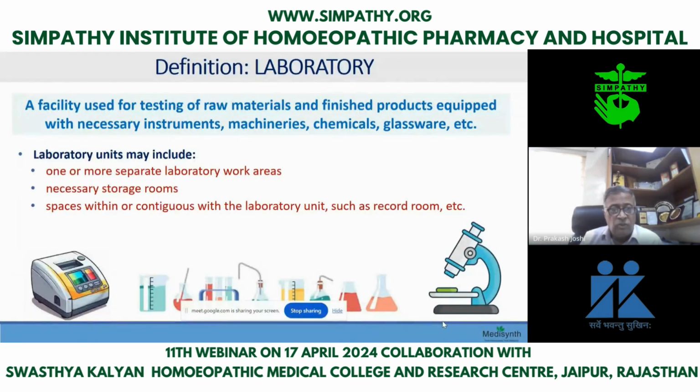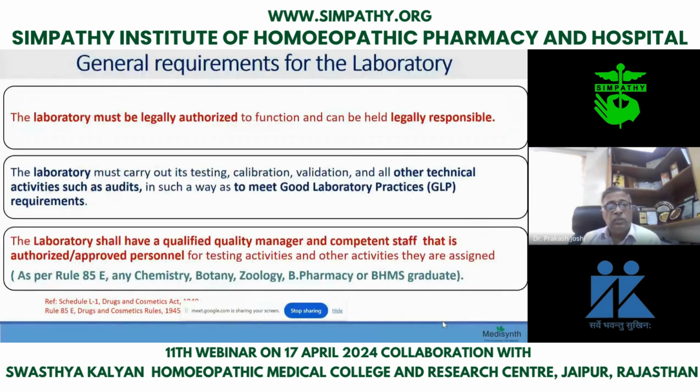Then you need to have storage rooms, spaces, and different laboratory units. That also we will be covering in the next few slides. Now, as I told you here, the laboratory must be legally authorized.